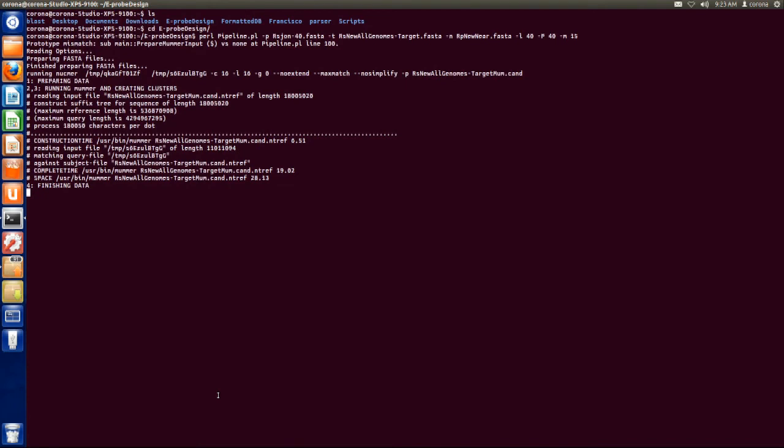And so once all those commands are entered, you'll just obviously hit the enter key, and then it's going to run through and compare the entire genomes of both those sequences. It's going to look for the unique sequences within your target FASTA file, and it's going to pull out everything that's unique to that file versus what it's looking at with the near neighbor file. So then what you'll be left with is a final output file that you've named that contains all your electronic probes.